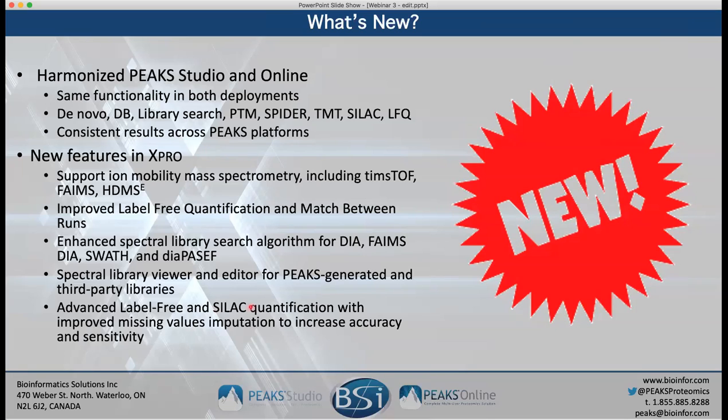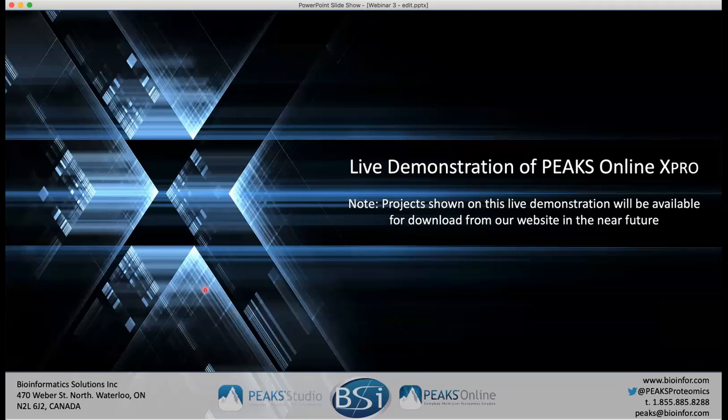And finally, advanced SILAC and label-free quantification. This comes down to really the improved feature detection, so that we're able to do better MS1 quantitation on SILAC as well as label-free data. And what I want to spend the majority of this time on is actually showing you PEAKS Online.